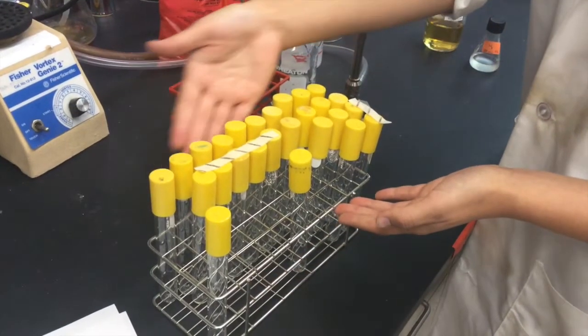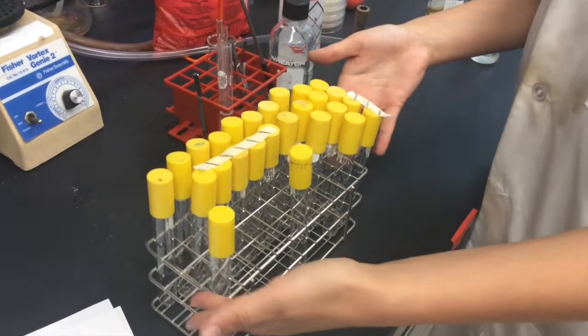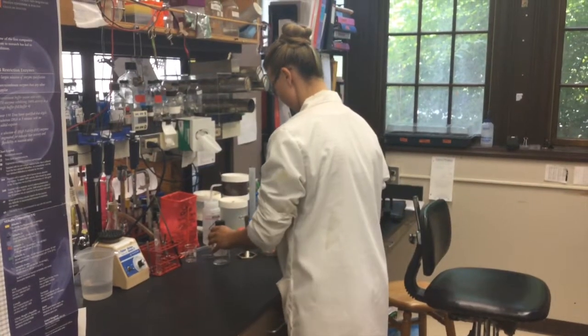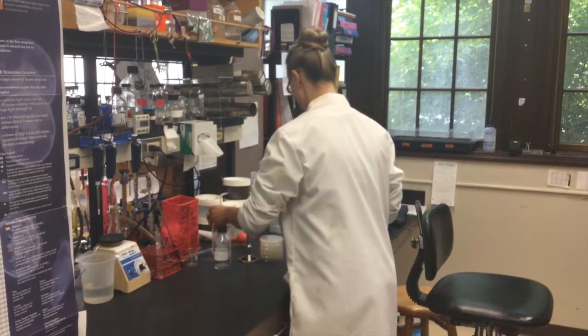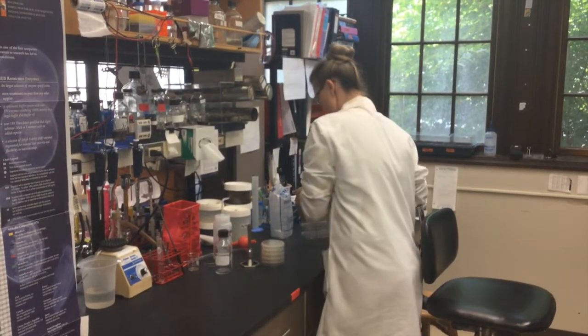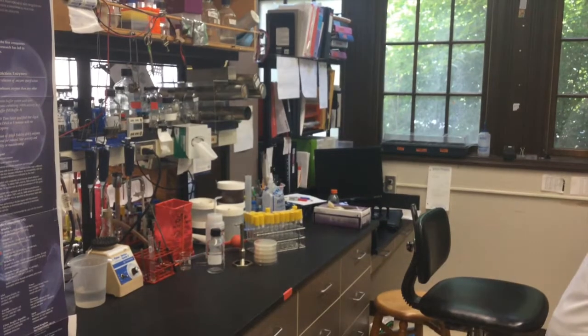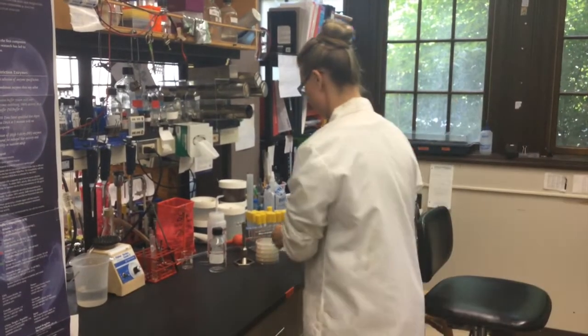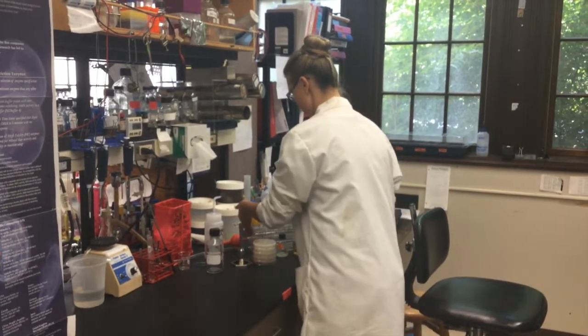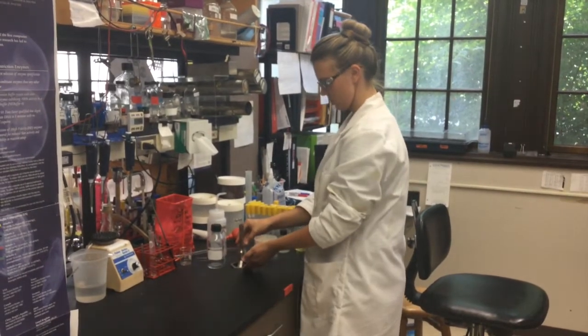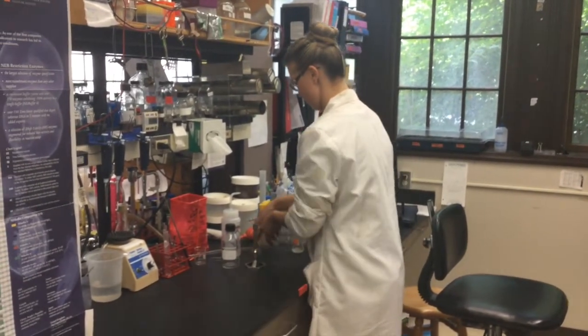All glass instruments being used should be sterilized prior. To gather all the equipment needed, aseptic techniques require you to be good at multitasking. So once you've started, you should not put any equipment still being used down. Equipment should be prepared and located close to the Bunsen burner. Make sure you and your partners are ready to work quickly and effectively.